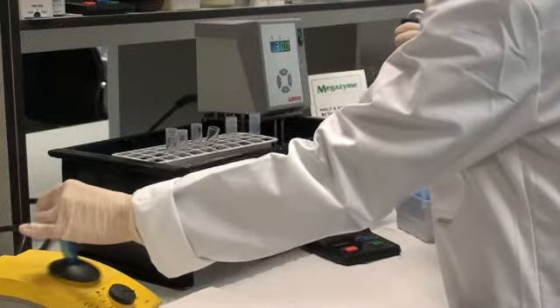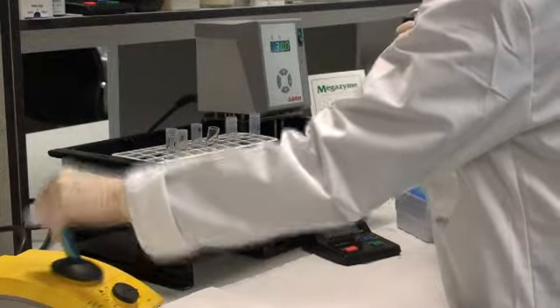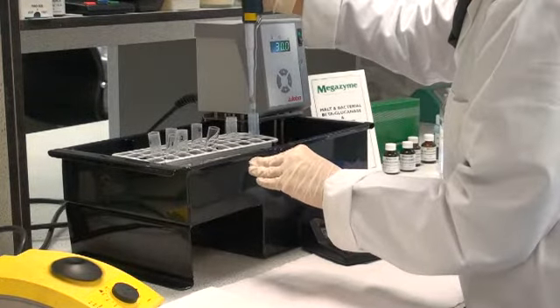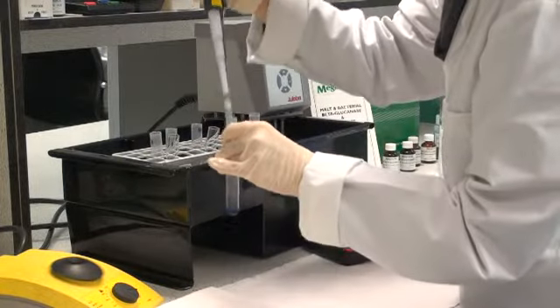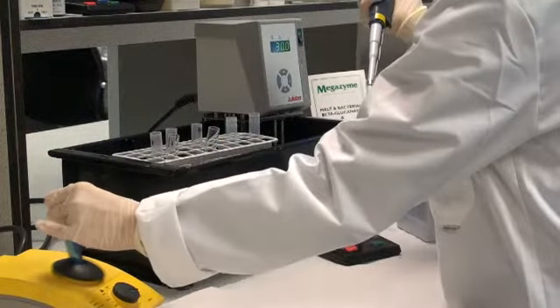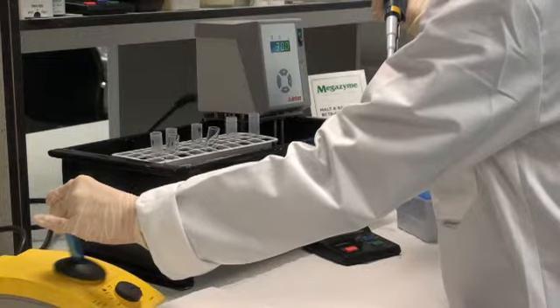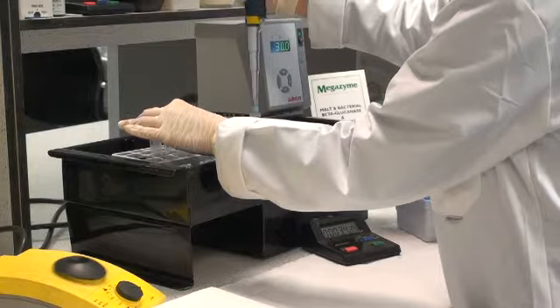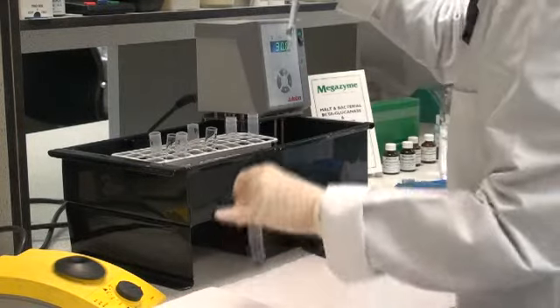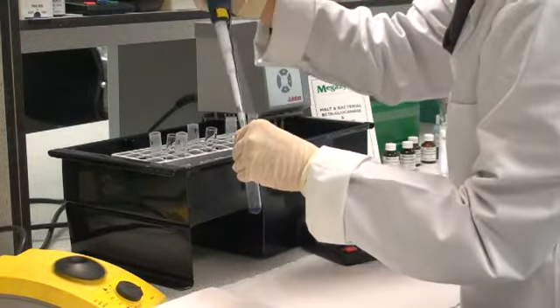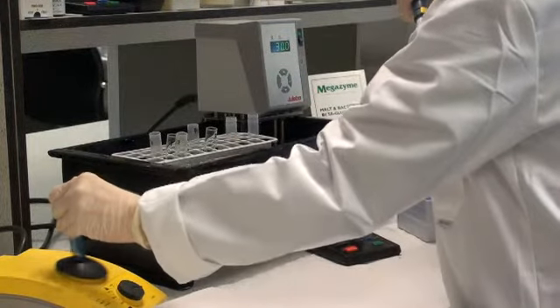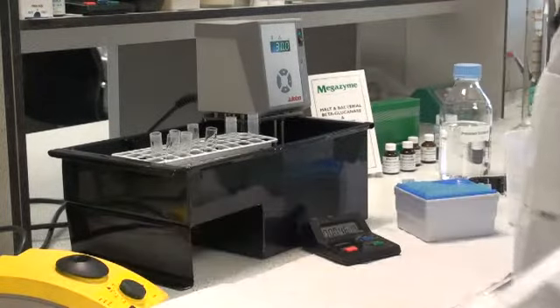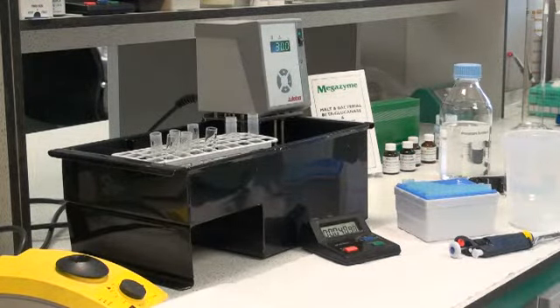Mix the contents extremely well on the vortex mixer. Change the tip and move to the second sample. Then add the enzyme extract to the substrate and mix well. Then add to the other duplicate after 15 seconds. Allow these to incubate at 30 degrees centigrade for exactly 10 minutes.